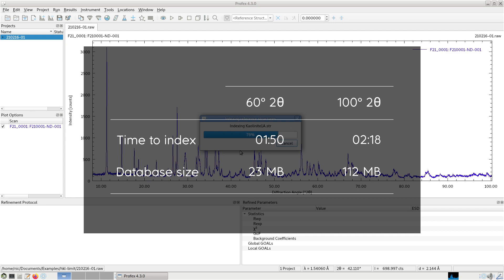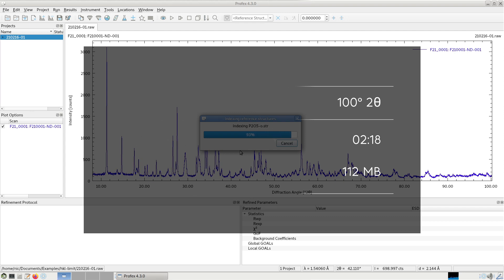But the buffer file is about 5 times as large. It's 112 megabytes.